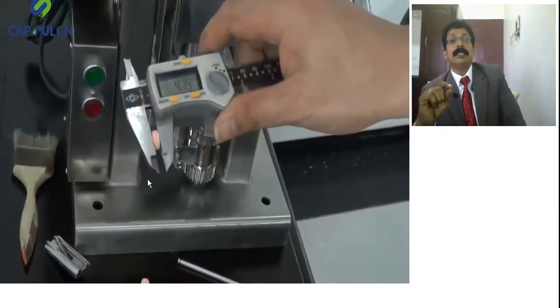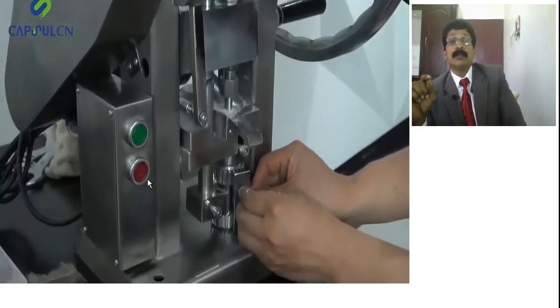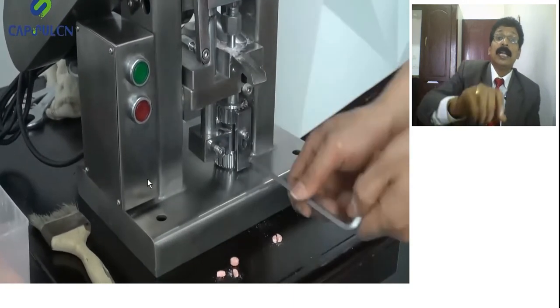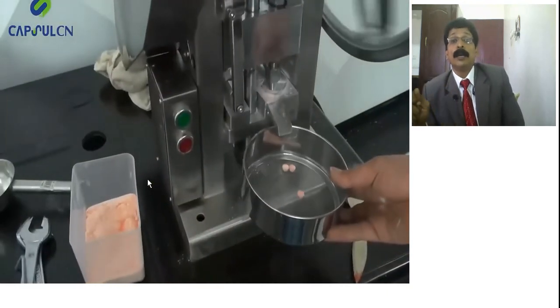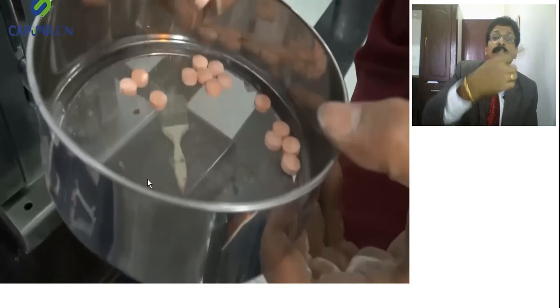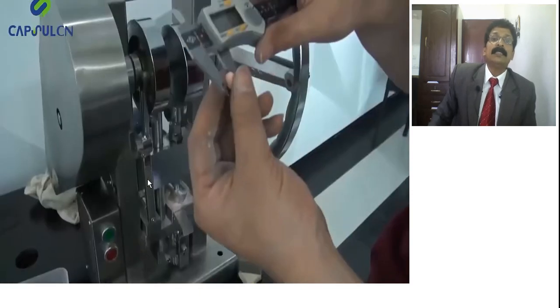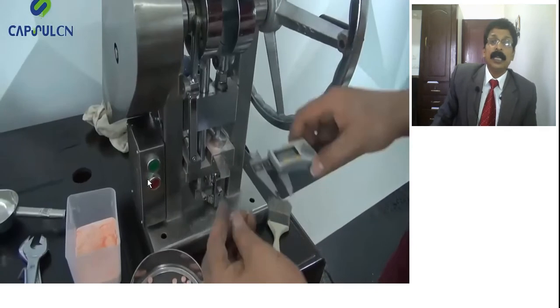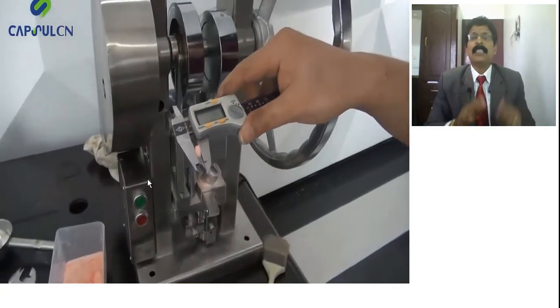Then they will think it is okay, and if they get the report from the quality assurance and quality control department, then they will fix it. See, he is fixing one lock so that it will not change. So the ejection screw and the compression screw are now fixed. Now you see how fast it is. He has put on the electrical system, and it will compress fast, and he will check for weight variation and thickness. Everything will be checked, so that they will find that very clear tablets can be made by a single punch. This is a small scale industry. Even in our college it can be performed.